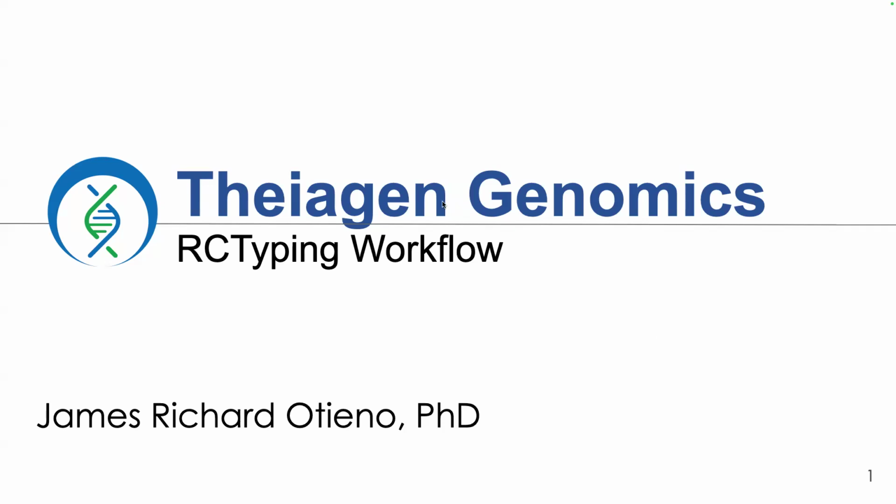So thank you everyone for coming in today. First, I need to apologize that I forgot to send the reminder email, but I'm glad that you've shown up today. So today we are going to talk about the RC typing workflow, which is actually the main topic for this training that was also developed by JIDC UK.